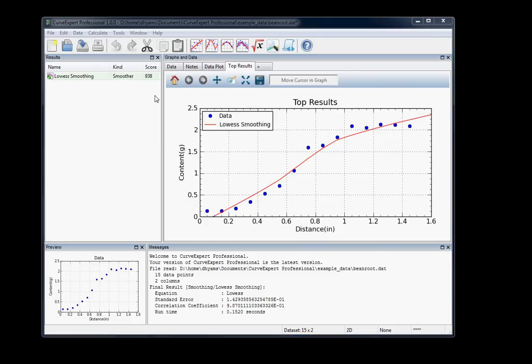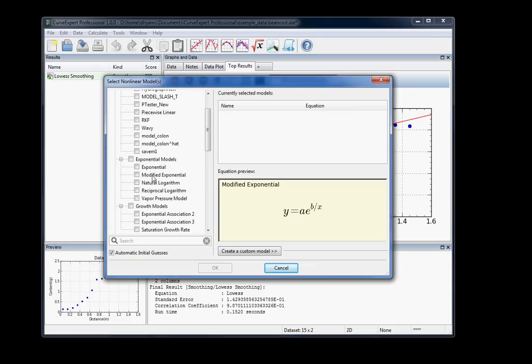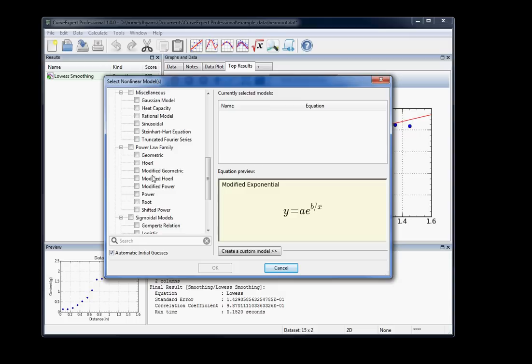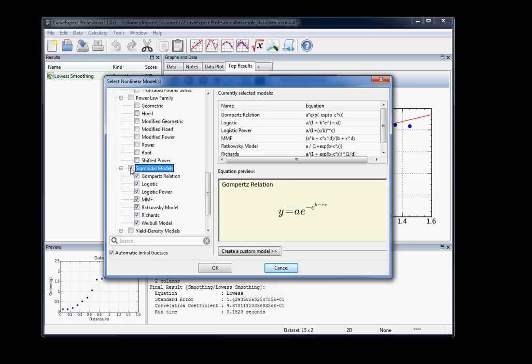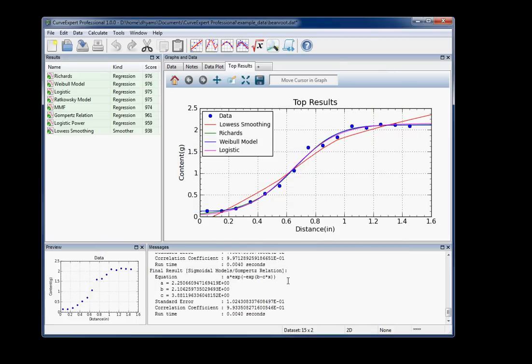What we'll do is choose Non-linear Regressions, and we'll select the sigmoidal family, okay, and calculate all of those at once. And so we'll just say okay. You can see all of those calculate, and as we point to those in this results area, you can see the preview updating to match.